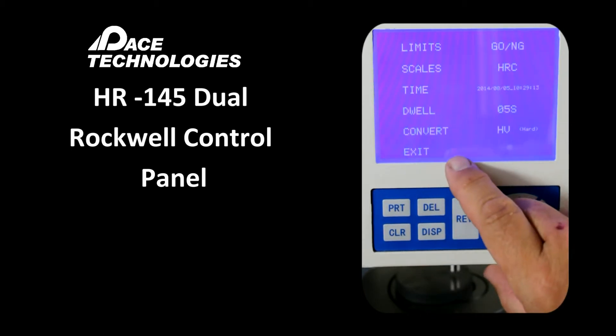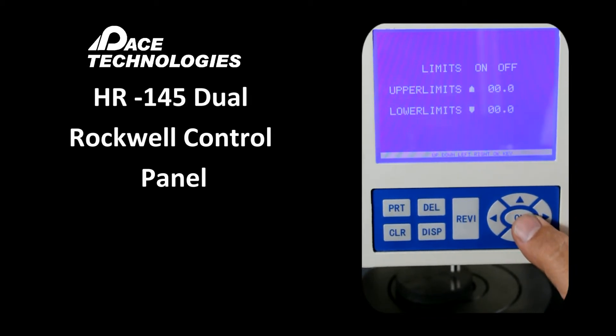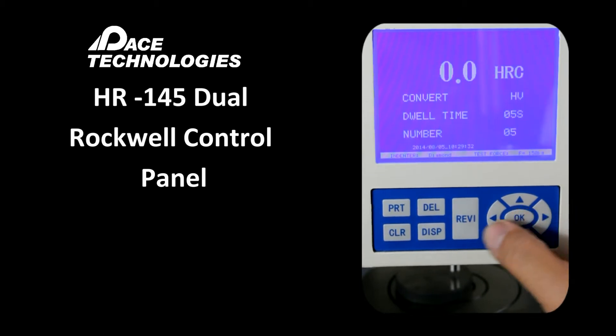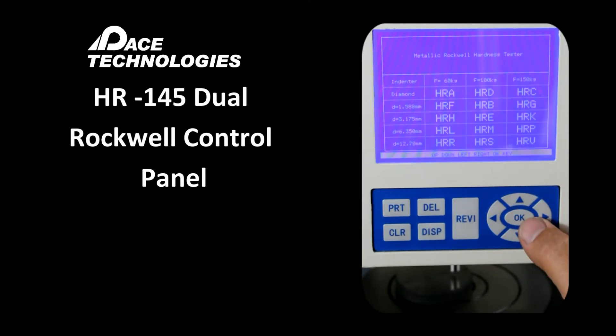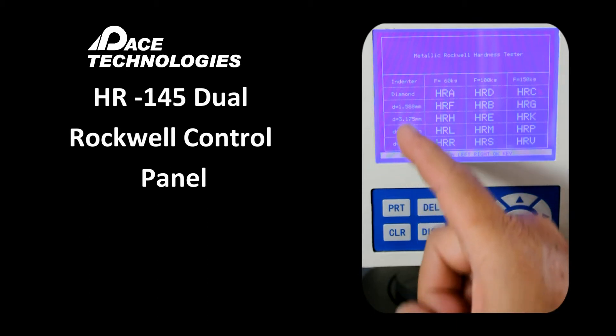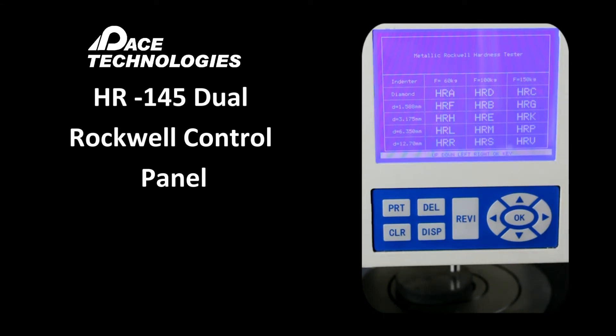We can see a flashing cursor in the parameters menu. Moving to the top, we have limits, which gives us a go/no-go for our measurements — we can set an upper and lower limit, or turn it off. The next variable is the actual scale. The unit is currently set for Rockwell, showing 60, 100, and 150 kilograms. With a diamond indenter at 150 kilograms, we will be measuring Rockwell C.